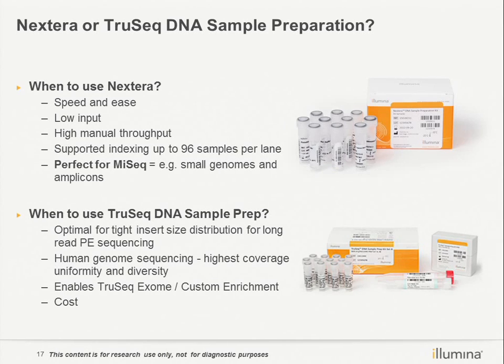If you care very much about coverage, uniformity, and the sequencing results, for example, you need to reduce the gaps, I suggest you use TruSeq because it's the widely used and classic method to prepare the DNA library, and the cost may be more economical than Nextera. So that gives you some suggestions.